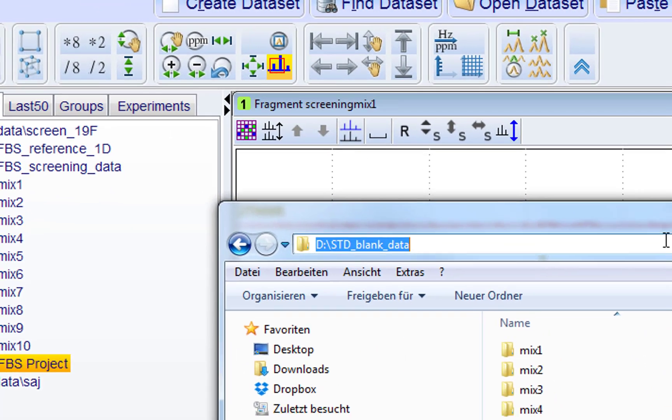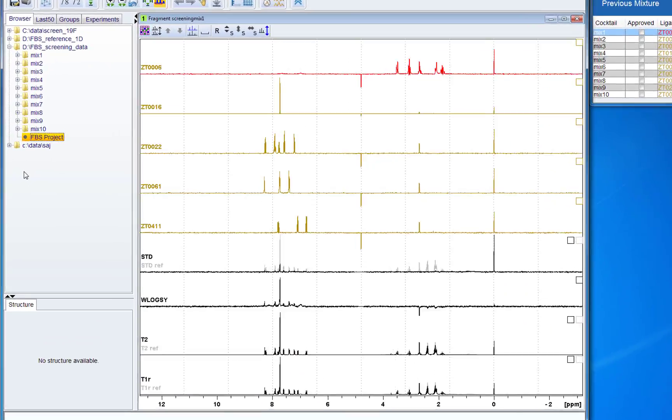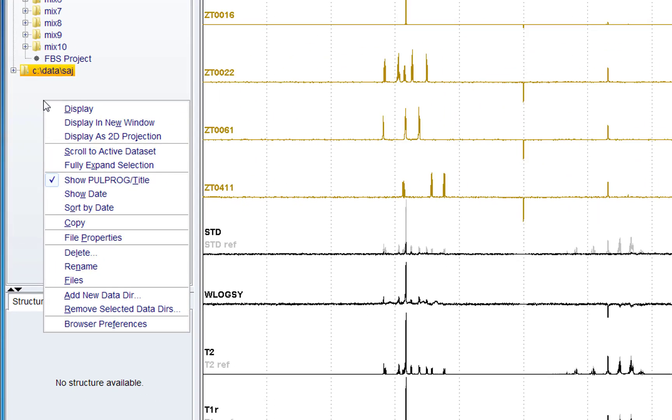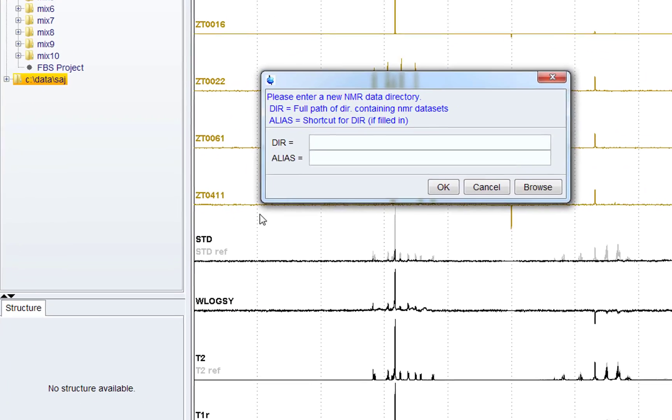In this case it is the blank spectra. These are spectra of mixtures but without the protein.